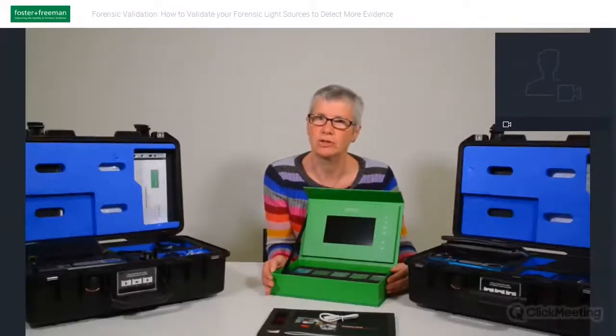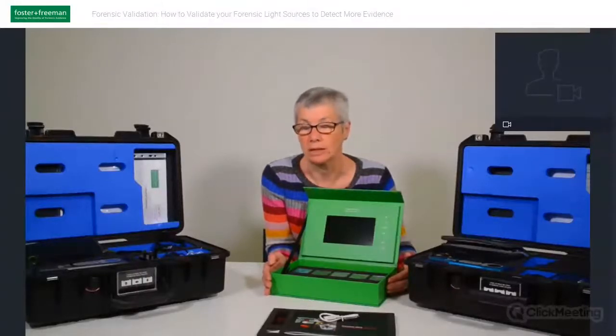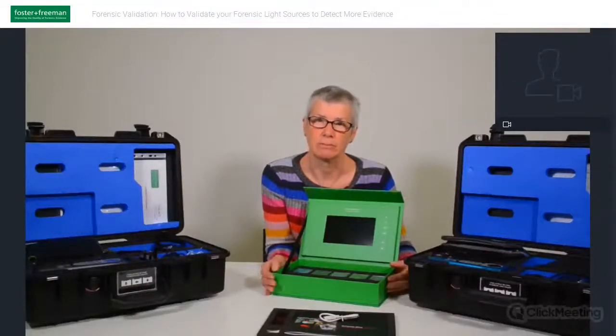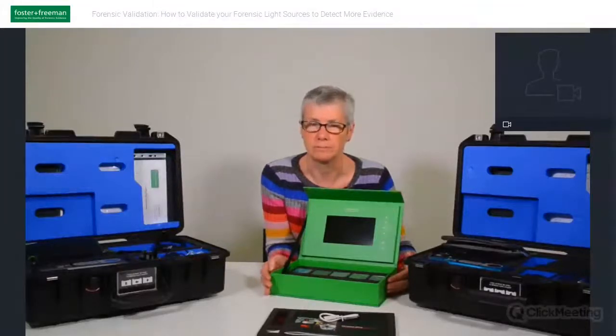Introducing a new technology, something like the Crime-lite Auto or perhaps our ML Pro system, into your crime scene or laboratory workflow will often require validation and quality assurance to prove beyond doubt that the equipment or technique is fit for purpose. It's something of a necessary evil that, while often being time-consuming and laborious, is essential to proving the quality of your work and maintaining the integrity of your evidence.